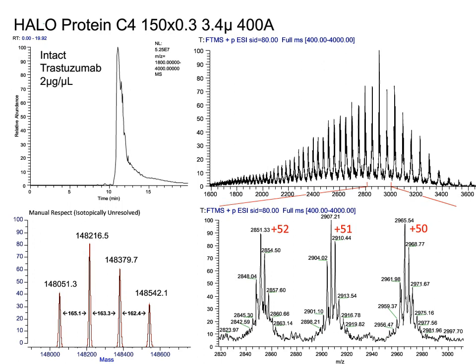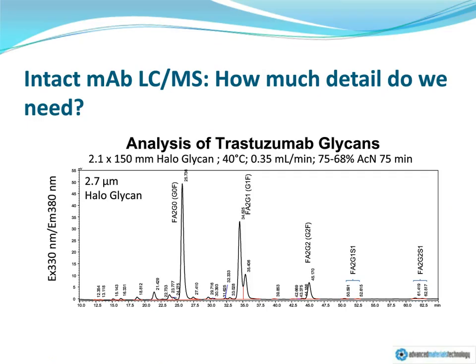And what I mean by that is these are monoclonal antibodies, and these monoclonal antibodies are a mixture of N-linked glycosylation modified proteins. As we usually look at monoclonal antibodies when we do glycan analysis, we typically see 2 or 3 main peaks in terms of the N-linked glycans.